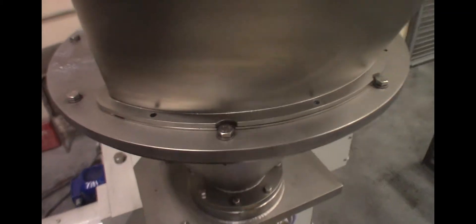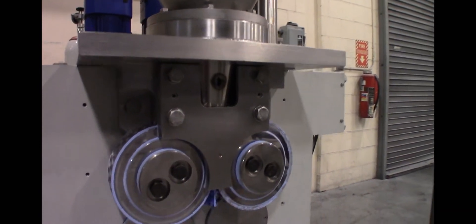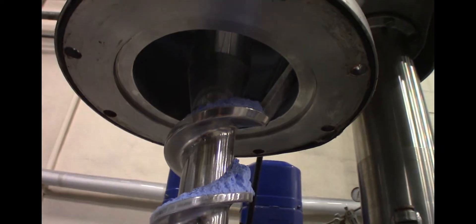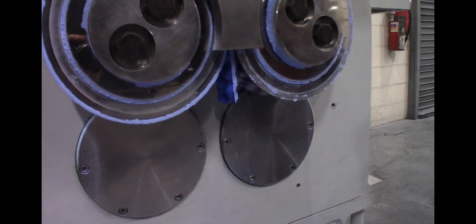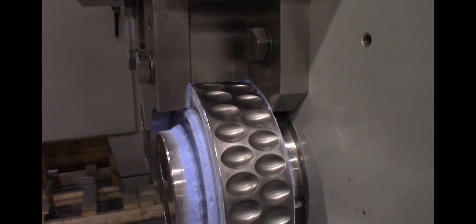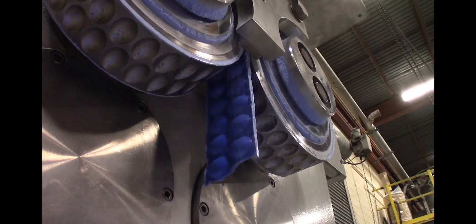The feed rate in this stainless steel model is approximately 200 pounds per hour, while larger models process up to 20 tons per hour. Hosokawa compaction systems use a screw feeder to press powder into the compaction zone, which has two briquette rollers that compress and shape the briquettes. In most applications, no binder or additives are required for compaction.